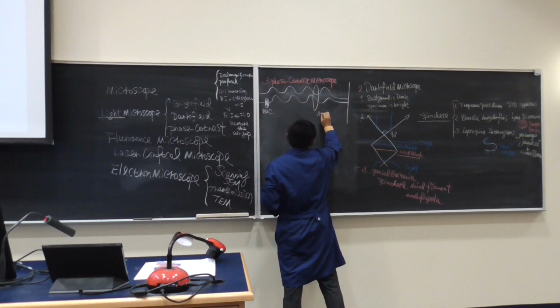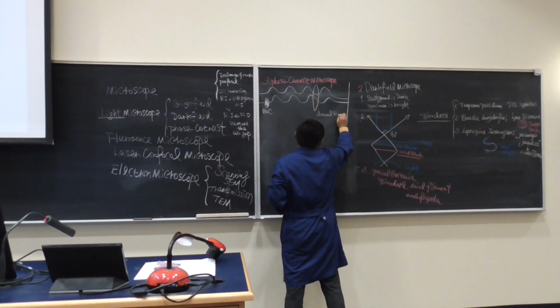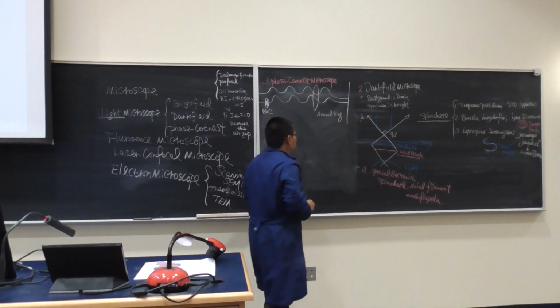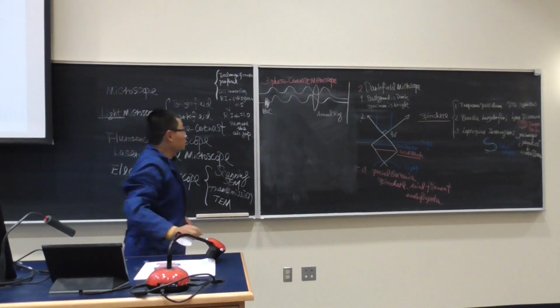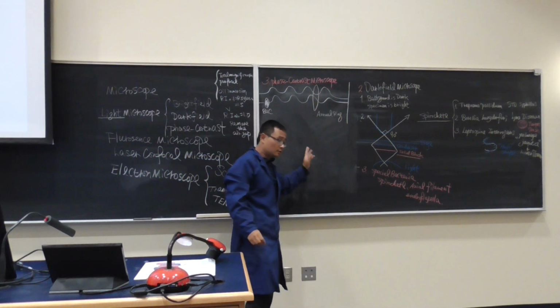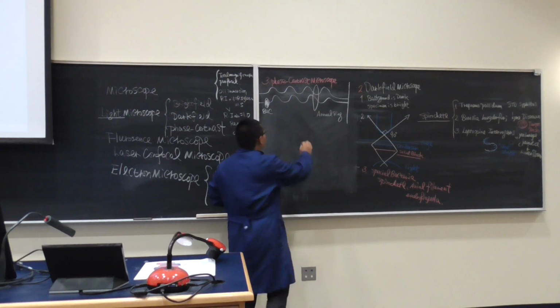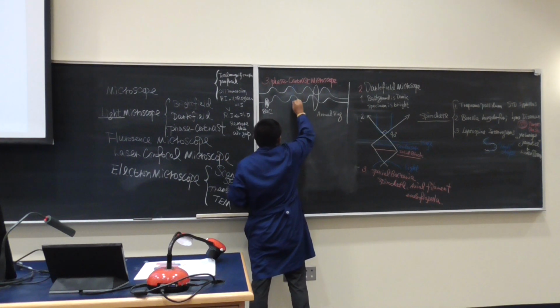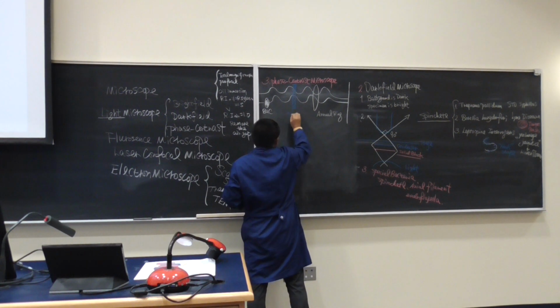This is called an annular ring. The magic thing for the phase contrast microscope is that somewhere in the middle of the microscope, above the condenser, above the stage, they put a phase ring there. I use this as an example. It is called a phase ring.